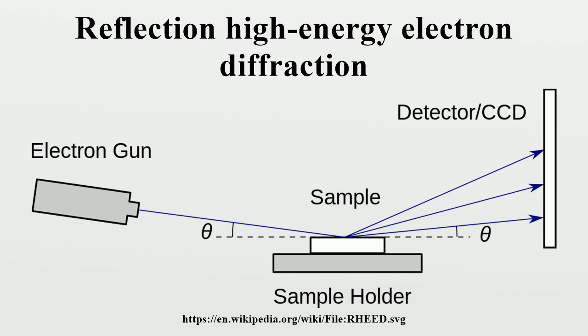Some of the electron waves created by constructive interference collide with the detector, creating specific diffraction patterns according to the surface features of the sample. Users characterize the crystallography of the sample surface through analysis of the diffraction patterns. Figure 2 shows a RHEED pattern.